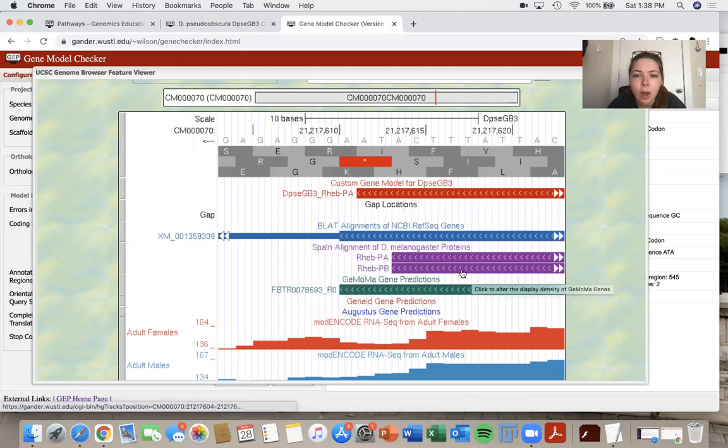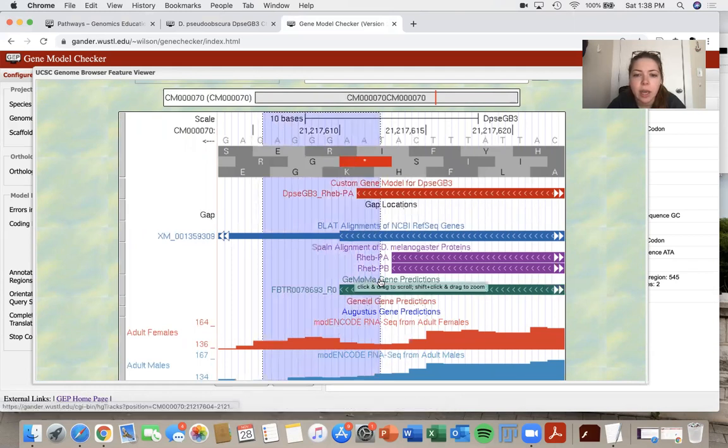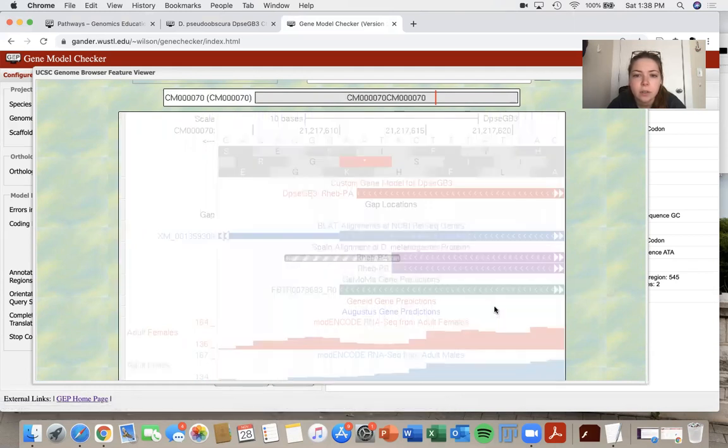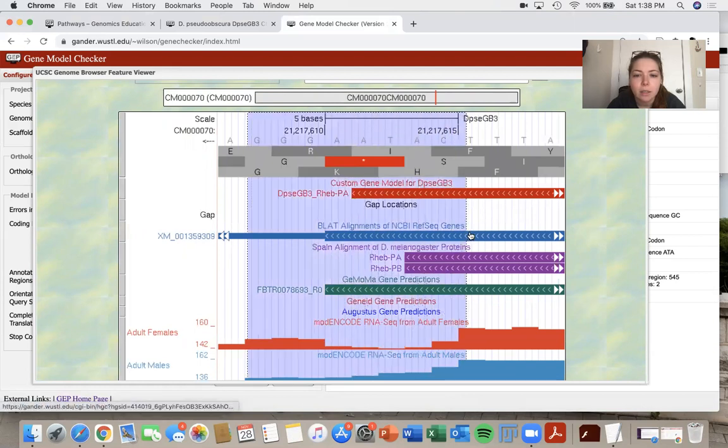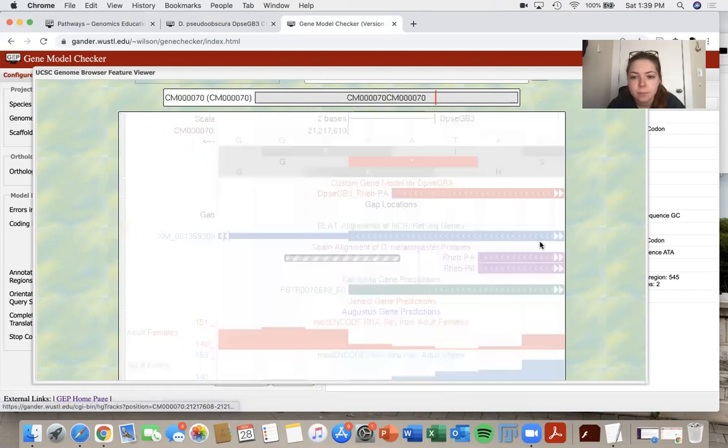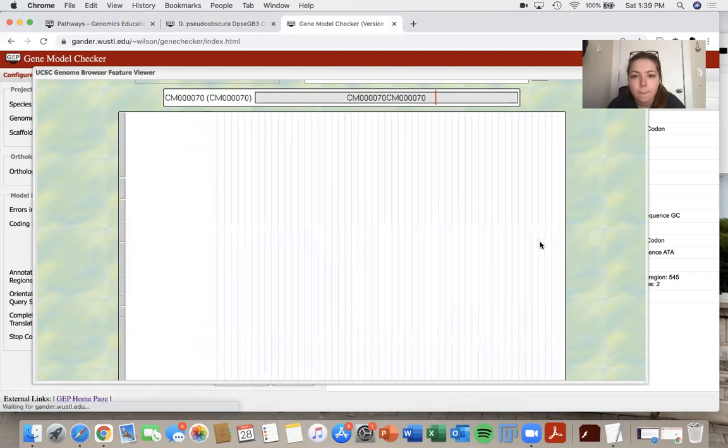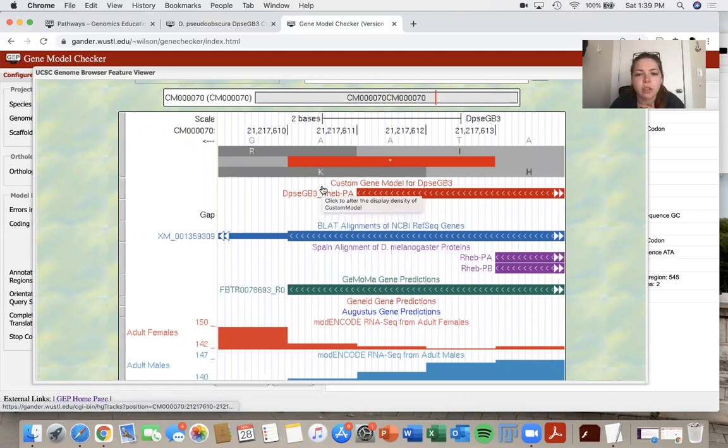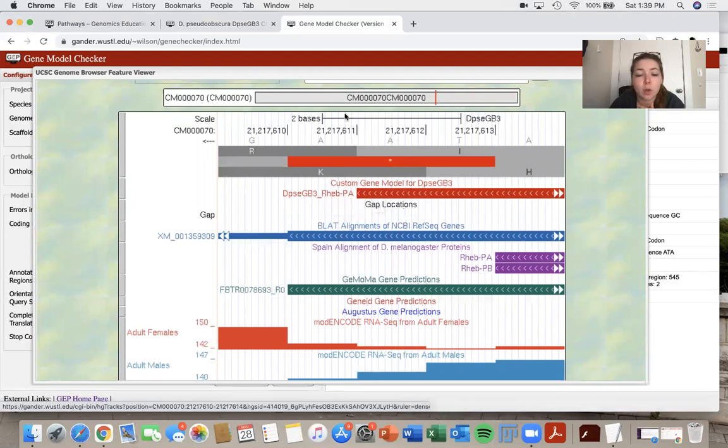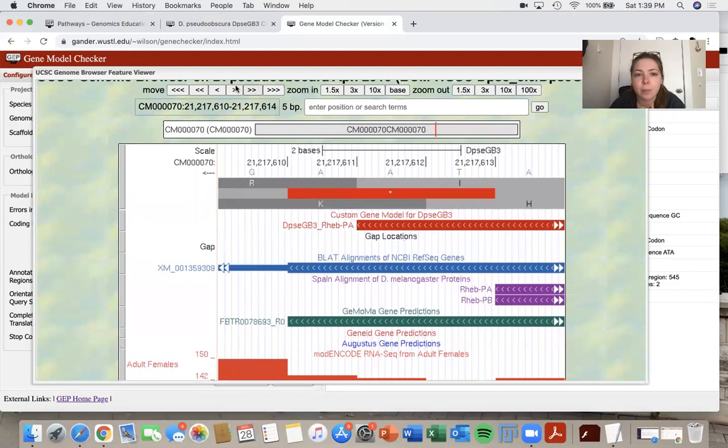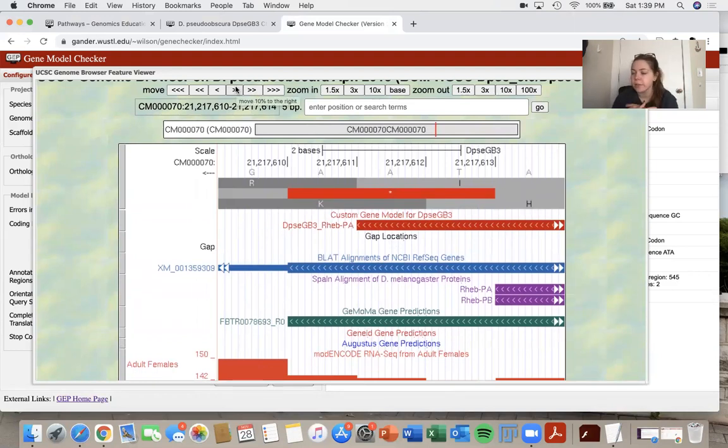So I'm looking at the end of my last CDS. And okay. So it seems like my custom gene model ends up one base short. So what that's telling me is that I put in a wrong coordinate somewhere, which is okay. It happens all the time. You just miss a number.